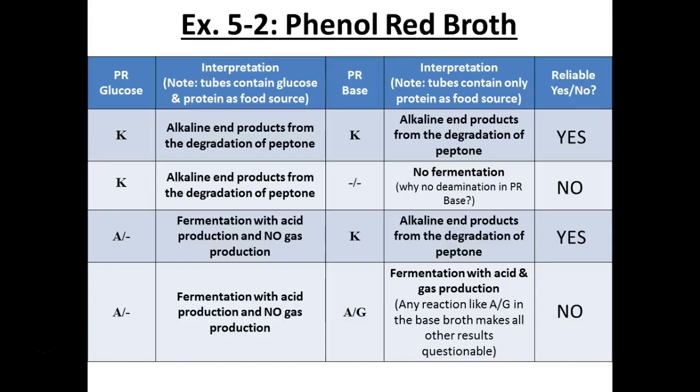Some bacteria will prefer to eat protein over carbohydrates. Yes. And those are the people who had the pink tubes.